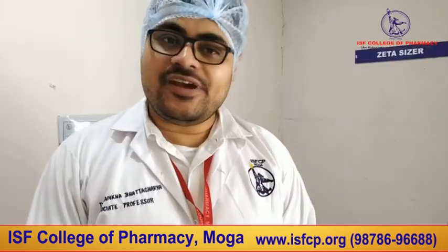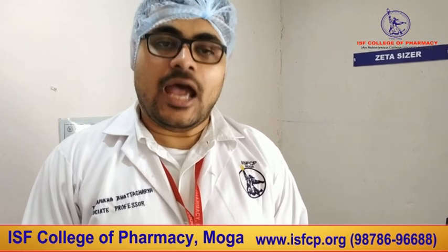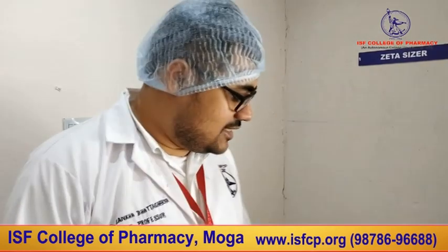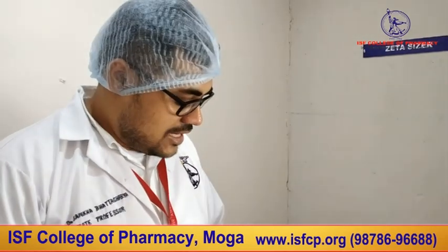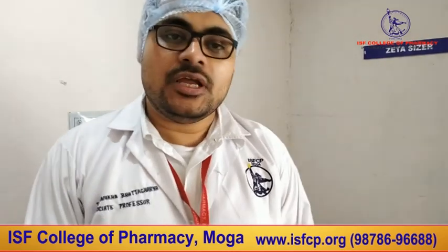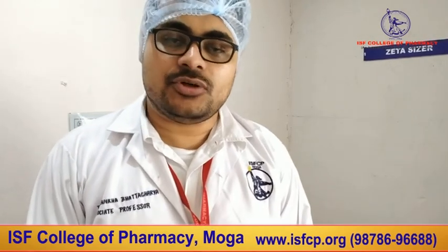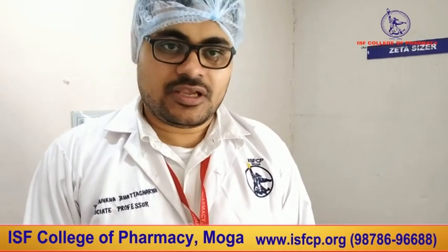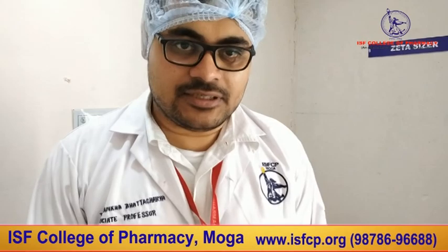I am confident that you have learned today about high-speed homogenization, ultrasonication and probe sonication, and subsequently the Zeta potential and particle size analyzer from the Beckman Coulter Delsa Nano C apparatus. I hope you have understood the basic principle of Zeta potential and particle size measurement by our sample nano formulation, nano emulsion. I wish you all the best for your future endeavors. Thank you so much.